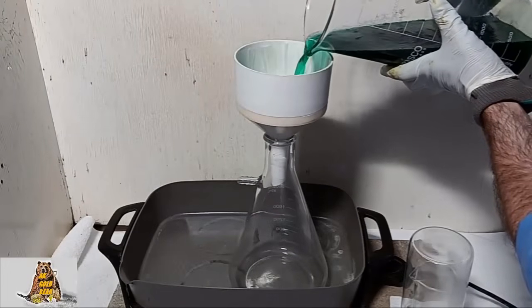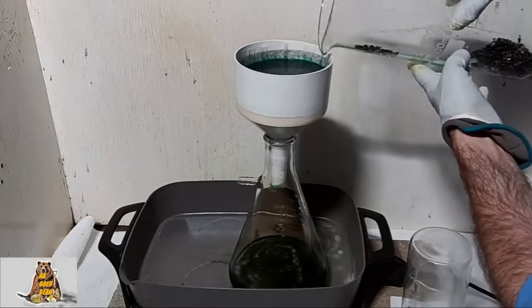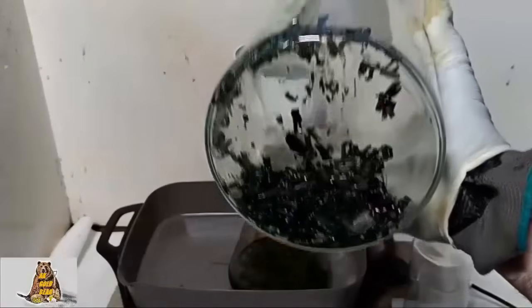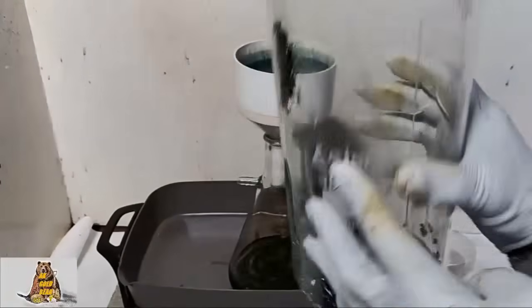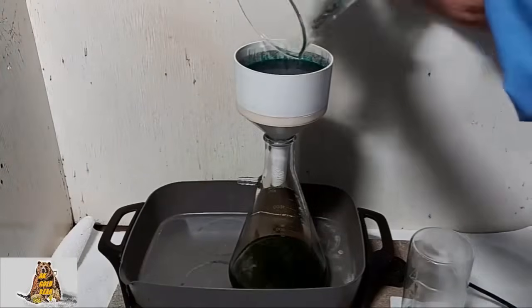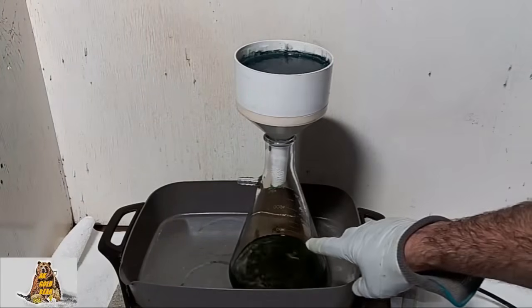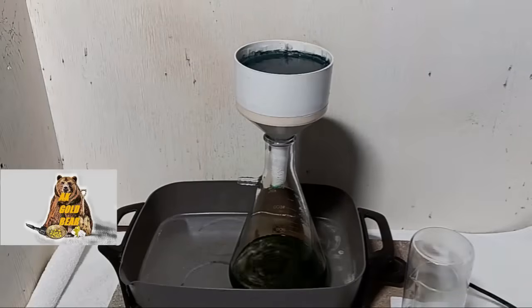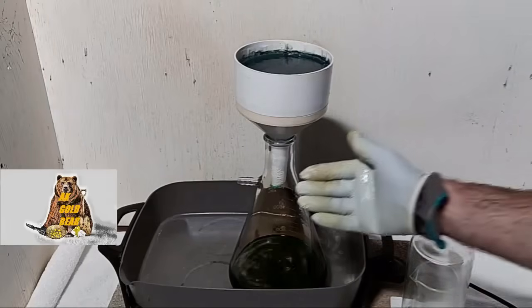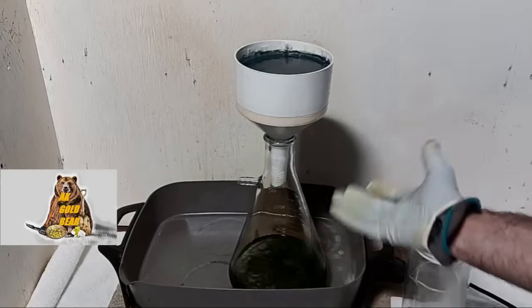Filtration. Pretty thick layer of gold flakes — very good. And in this copper nitrate solution there should be silver, because some watch bands had white gold. Copper nitrate — or copper nitrate with silver nitrate.